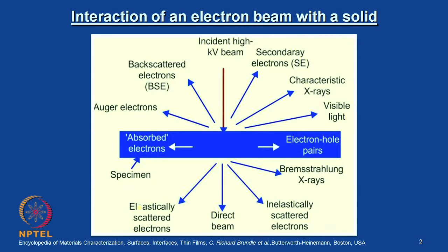Before we get into any of this electron optics based instrumentation, which is used for imaging of materials to reveal the microstructure details, first we should know about the interaction of an electron beam with a solid. It is very general information which one should remember. I will tell you the importance of this the moment I finish this discussion here. So, look at this schematic.